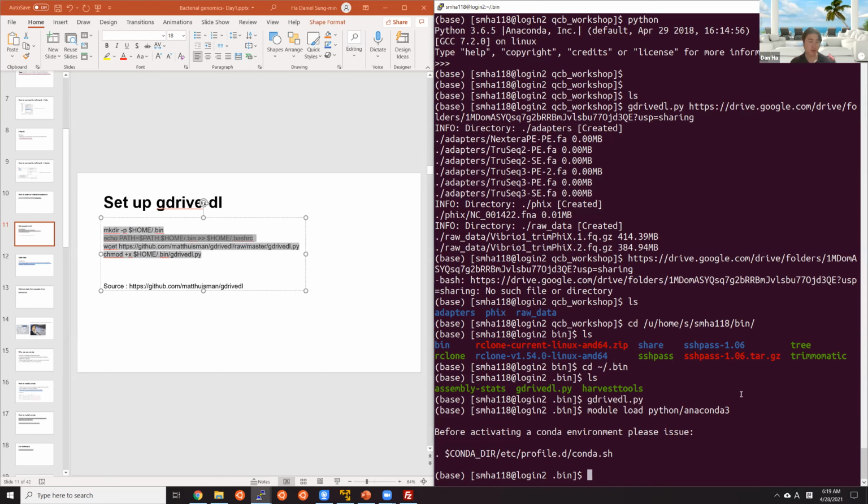So bashrc is your environment variable file, right? So sometimes it has to be reloaded. Like if you have relogged into your terminal, it should have worked, I guess. The source command I just gave you sort of reloads the entire environment variables. Okay, thank you.